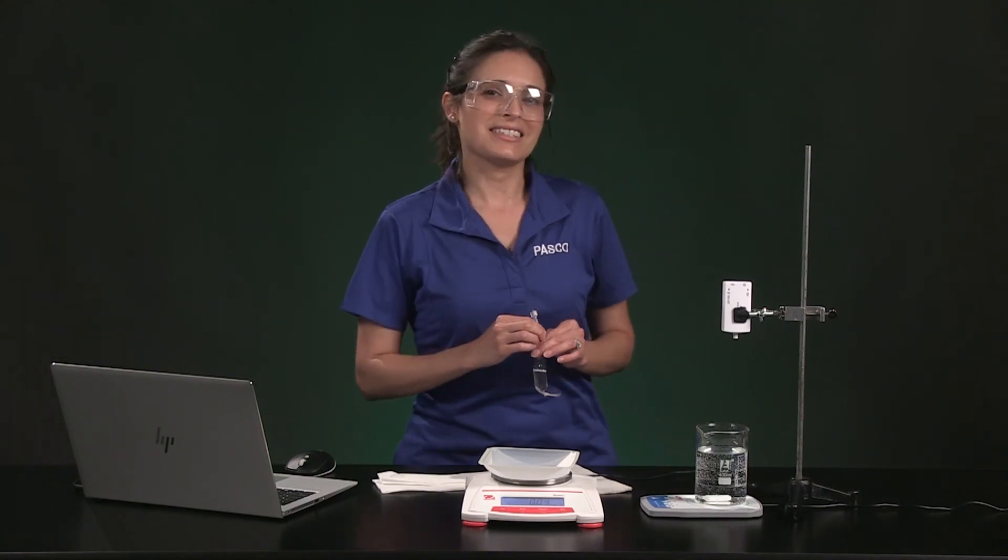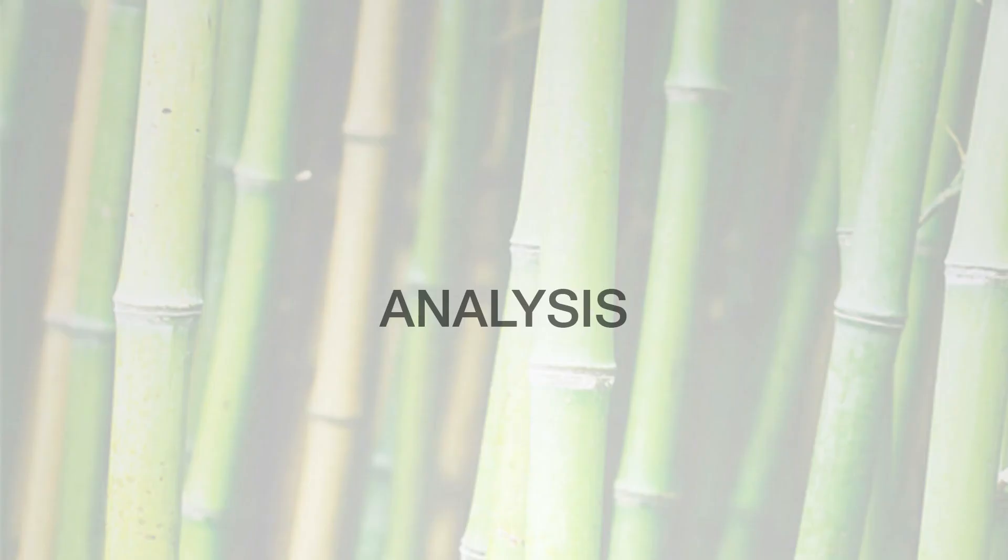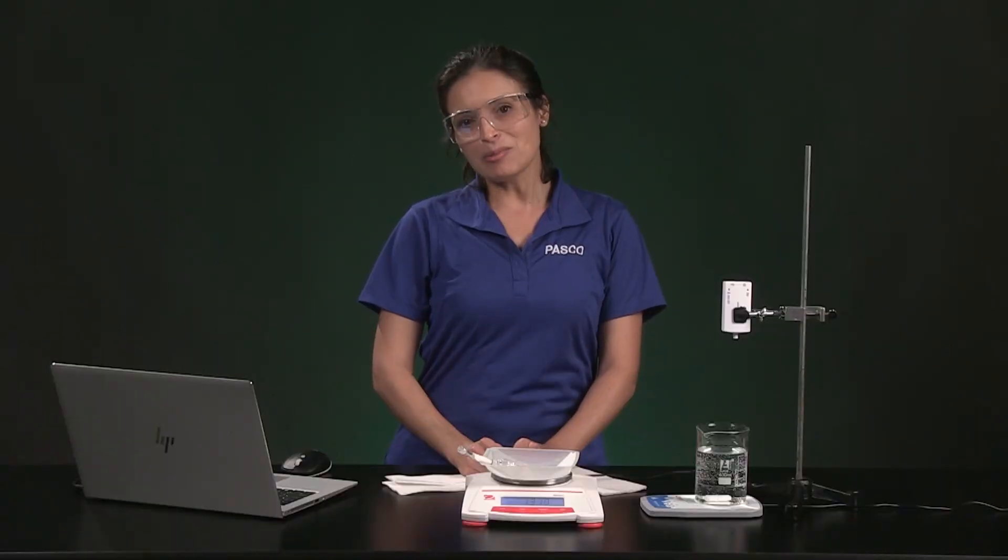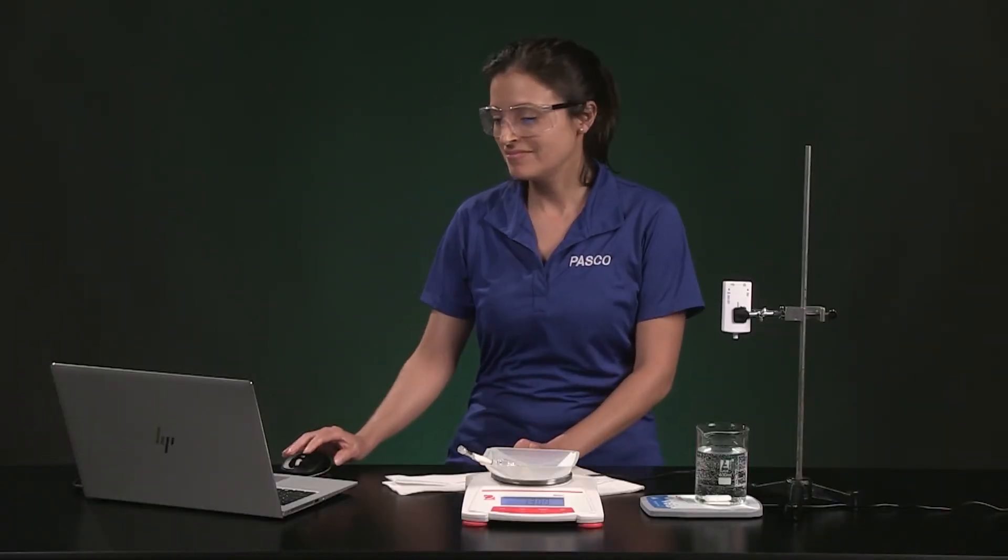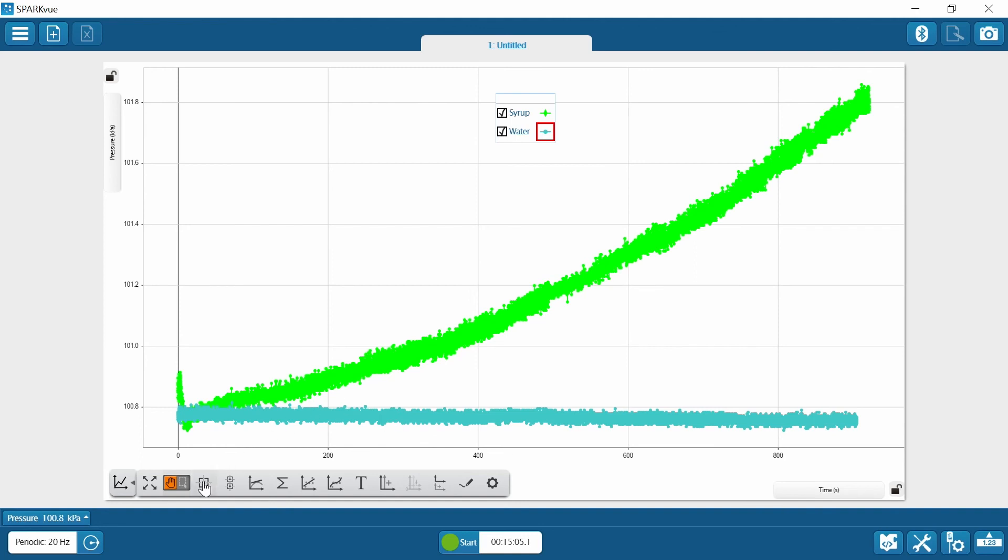Let's move on to analysis. In table one you will need to record initial and final pressure for each run. Use the coordinate tool in Spark View to help you get these values from the data. These are XY coordinates. So the first value is time and the second value is pressure in kilopascals. I can click and drag the gray box to move it to initial and final data points on each run.